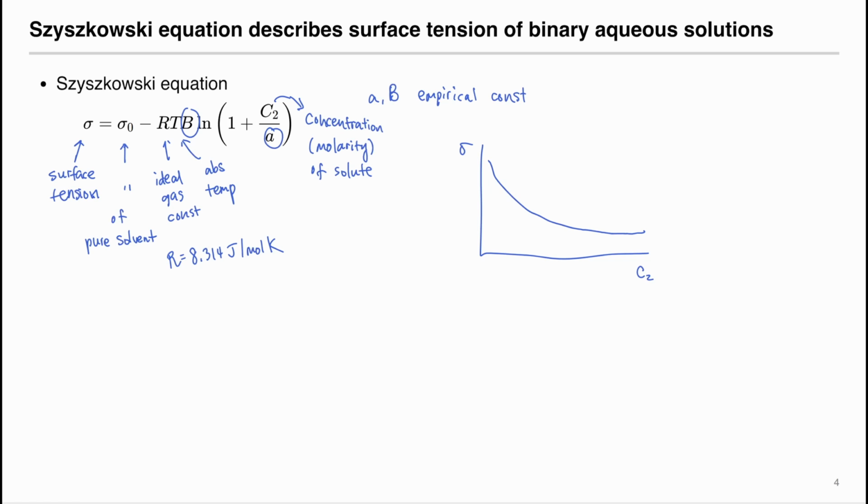What we want to do in this experiment is determine how lauric acid concentration changes the interfacial tension between the water and oil. That is because lauric acid has a hydrocarbon tail, and at the end it has a COOH group. The hydrocarbon tail is hydrophobic, and the COOH group is hydrophilic because it can interact with water by forming hydrogen bonds.